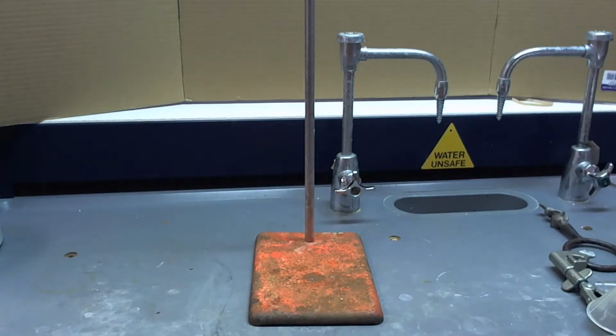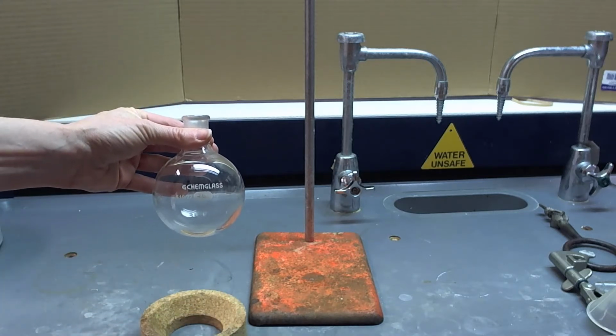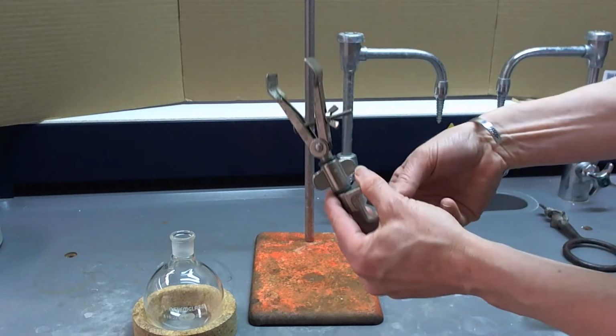A very common technique is to heat a reaction under reflux conditions. So let's go over how to do that. We typically will use a round bottom flask in this situation, which can be held and propped up by a cork ring really nicely. You want to start by building a good apparatus using a firm clamp.